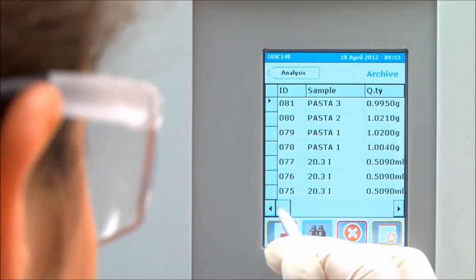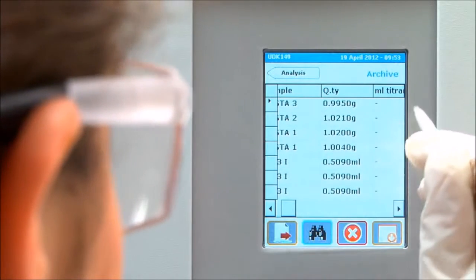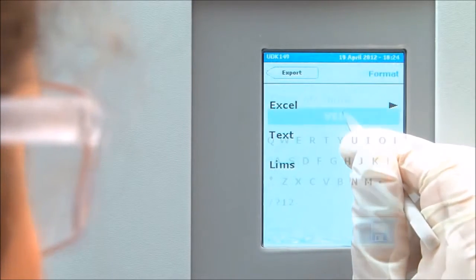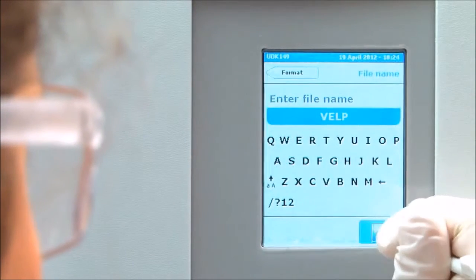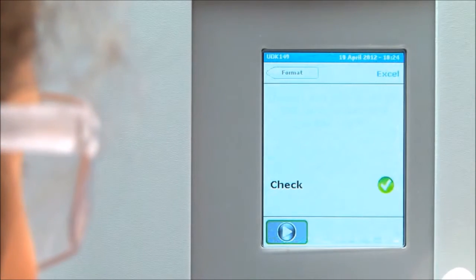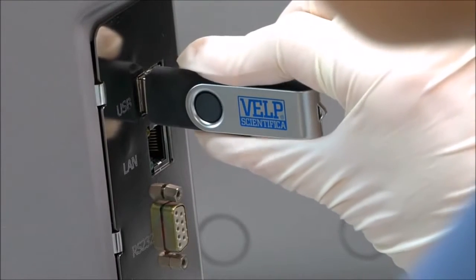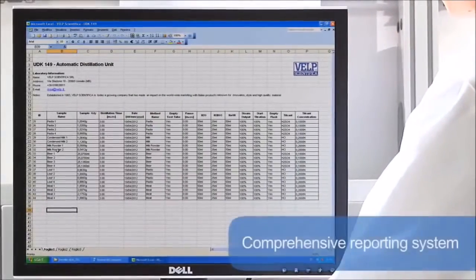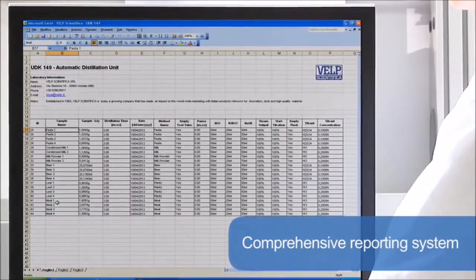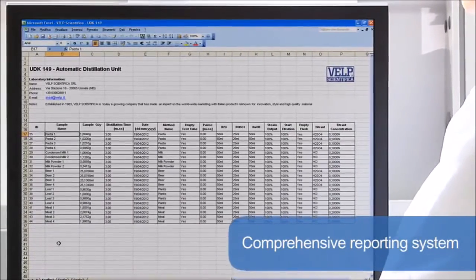After the analysis, all the results are shown on the display and stored on the onboard archive for improved operation and traceability in accordance with GLP. Results can also be exported with a USB pen drive or managed with remote control via Ethernet. The comprehensive reporting system offers downloading to PC and transferring to LIMS for maximum flexibility of data management.